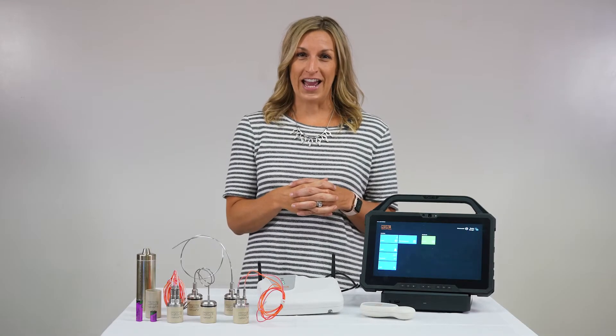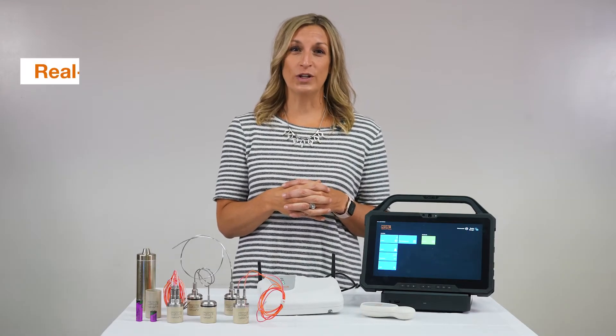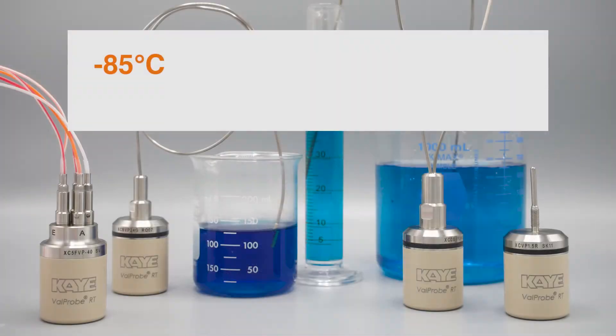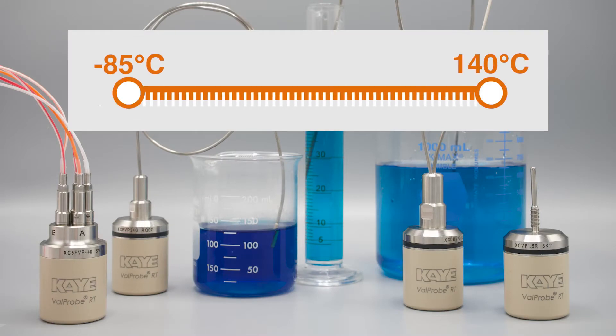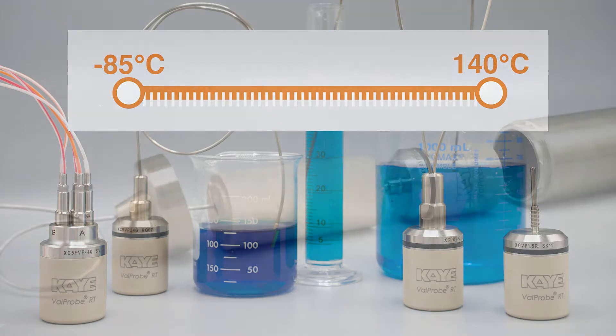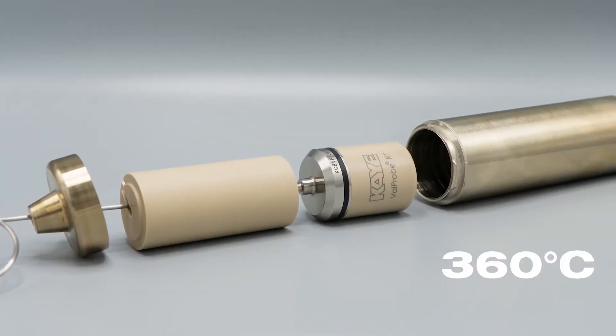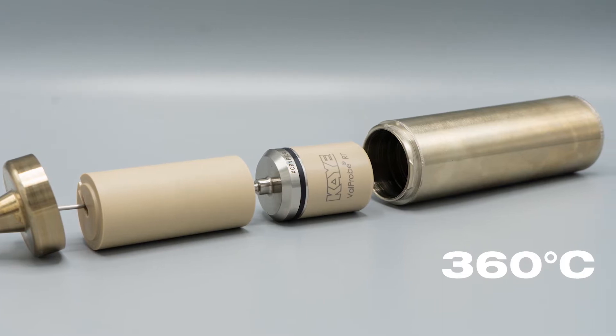Hey everyone, it's Brianna with K, and I'm here to share our new real-time wireless valve probes. Our wireless valve probes are meant for harsh environments, so you can use these probes in negative 85 degrees Celsius up to 140 degrees Celsius. We also have an extended range of 360 degrees Celsius using our insulated canister.